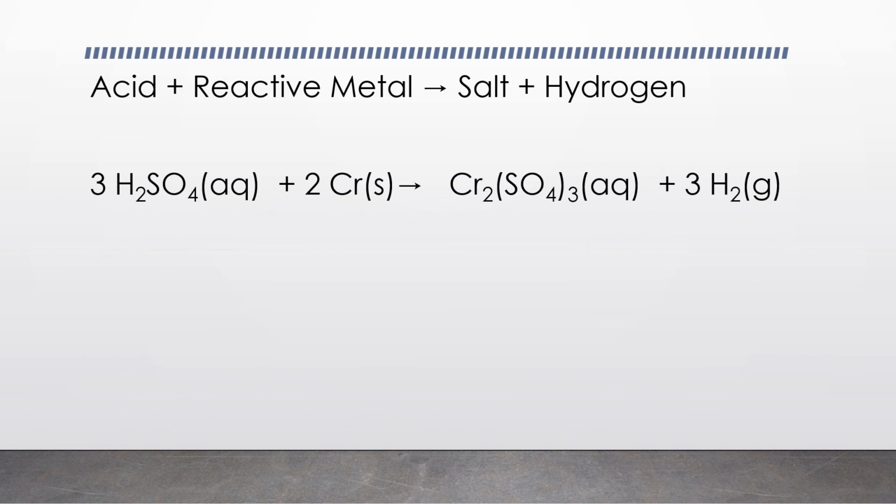So our overall observation would be a colourless solution, a silver solid, a deep green solution, and a colourless, odourless gas.